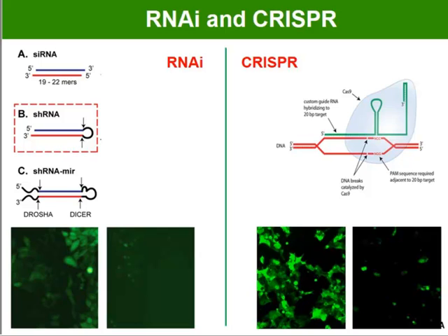And so the ability here is that with the RNAi or CRISPR technology, you can screen large numbers of genes by simply designing the effector molecules in silico, and then synthesizing them and introducing them into cells. I'll talk a little bit about the RNAi platform that we've developed and have been working with for a number of years, and then how we're also now bringing the CRISPR platform online for these types of screens, and the comparison of the two.